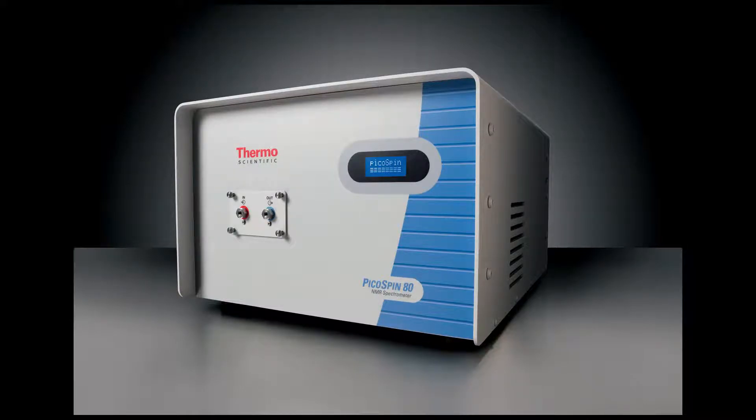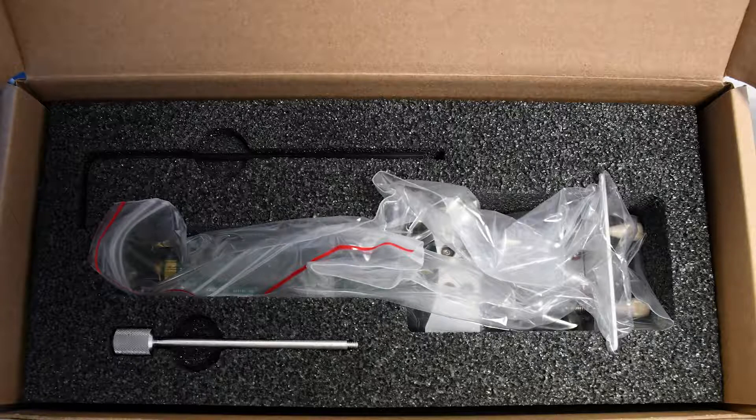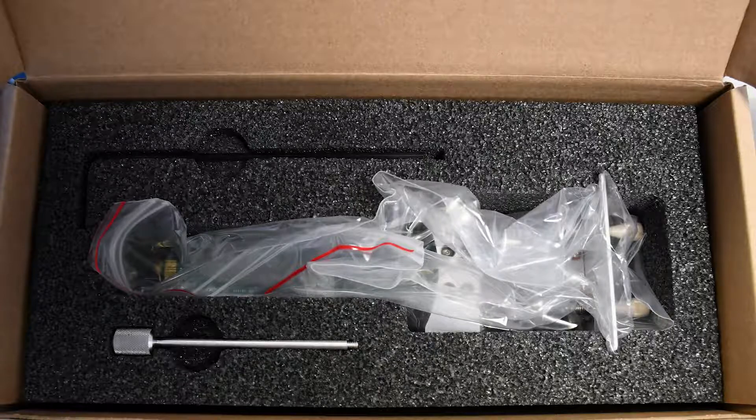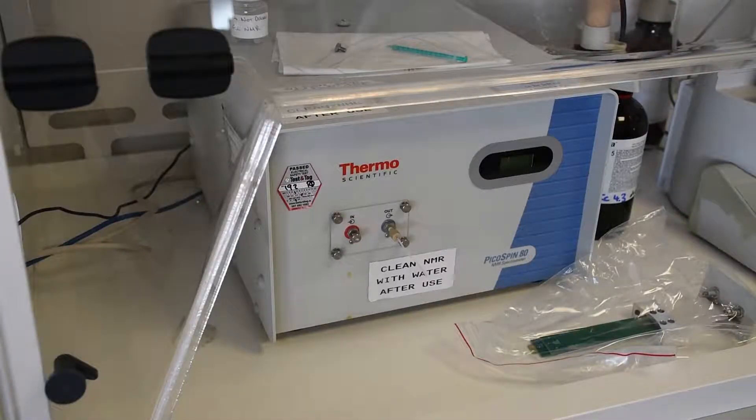This is a demonstration video for replacing the cartridge in a PicoSpin 80. If you are replacing the cartridge, you will have bought a new one which will look something like this. It is safely stored in a plastic bag and you should leave it there until you want to use it.